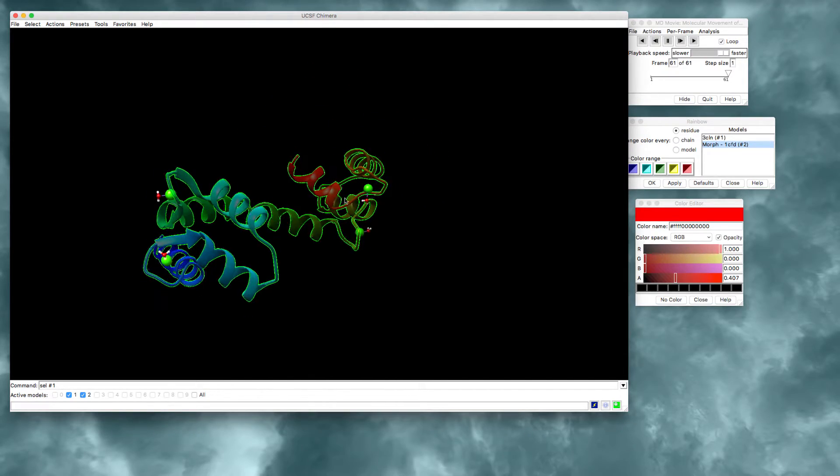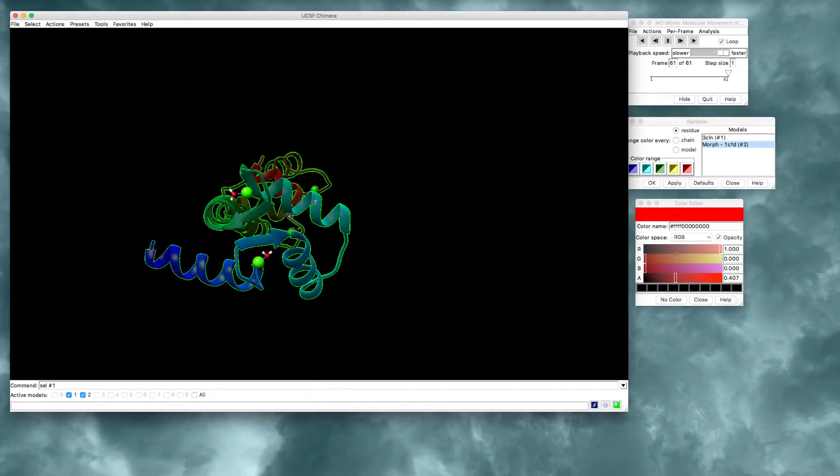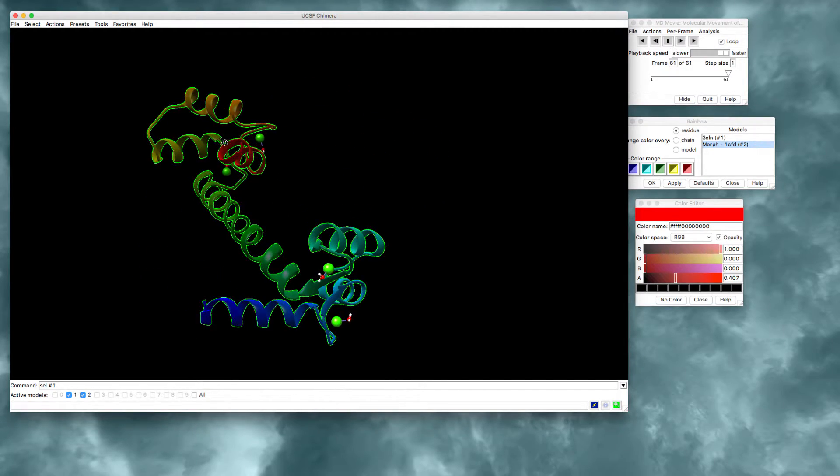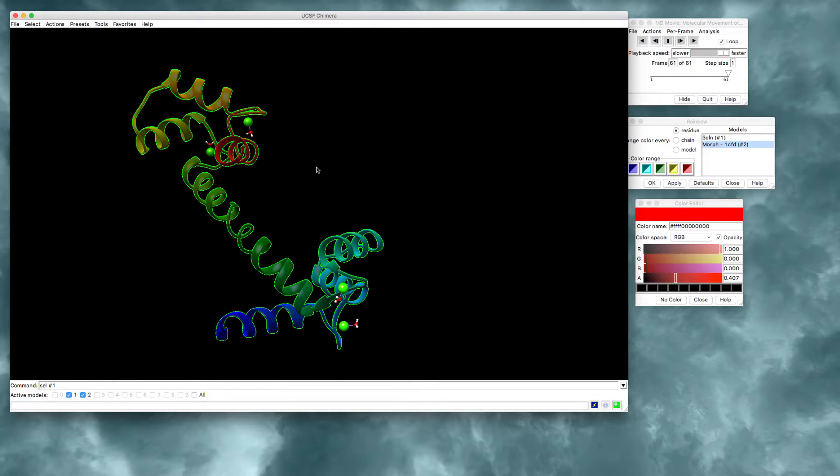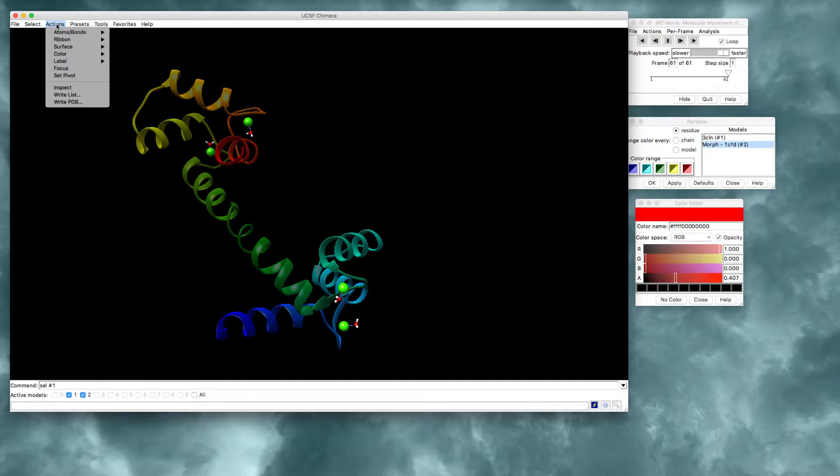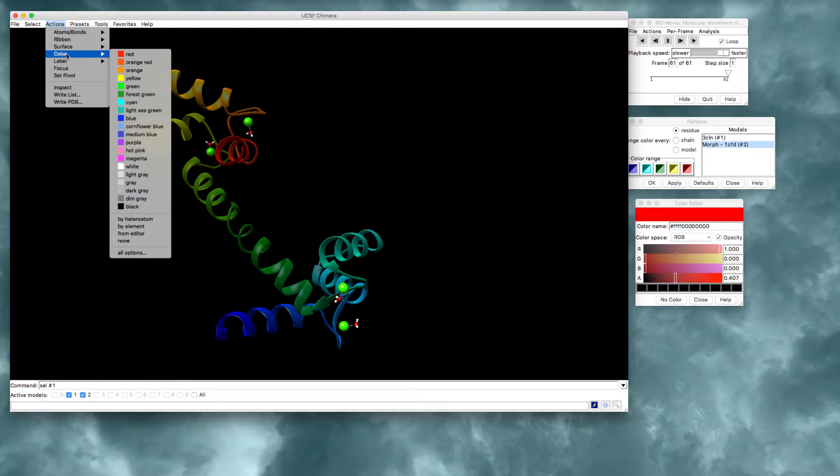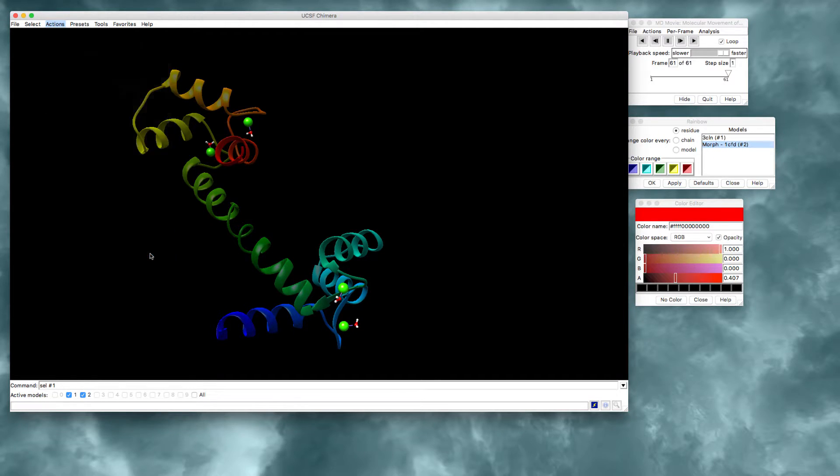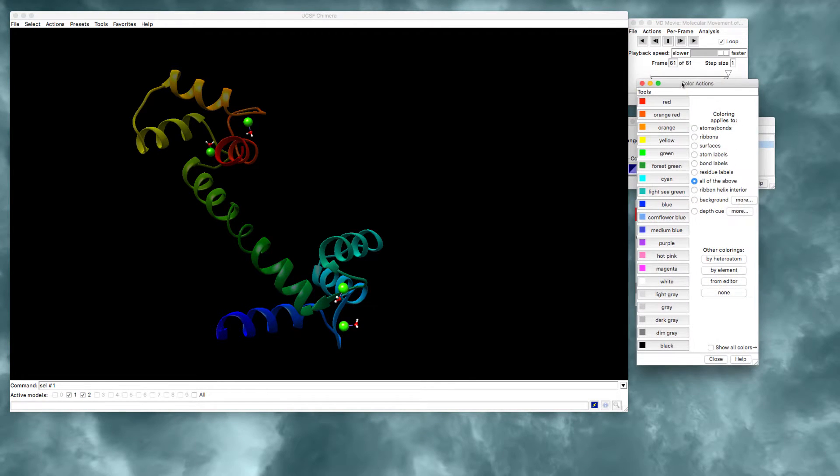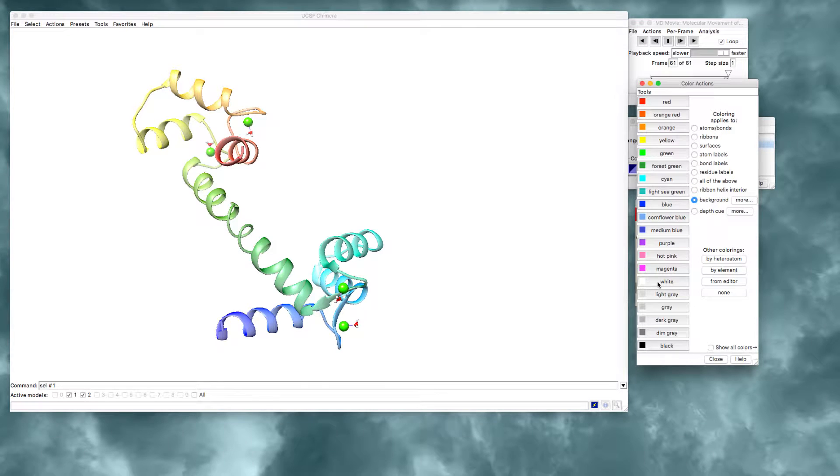I'd also like to change the background color here. So there's a couple options you have for background. You can unselect the ribbon diagram by pressing control and clicking in the background. And now I'm going to go to color and all options. And here I will choose that I would like to control just the background. And you can make this white, for example. So I like the white background with the transparent ribbons.